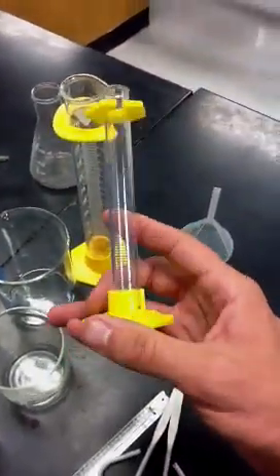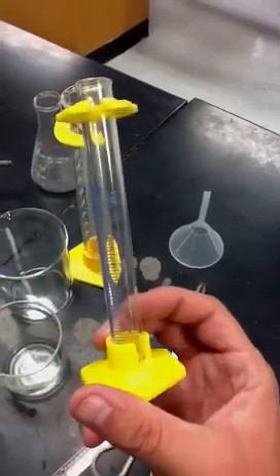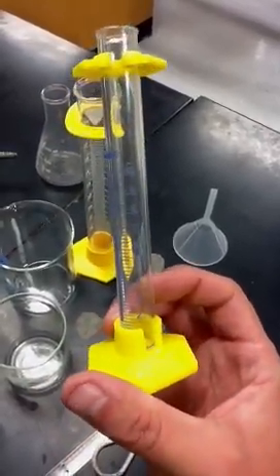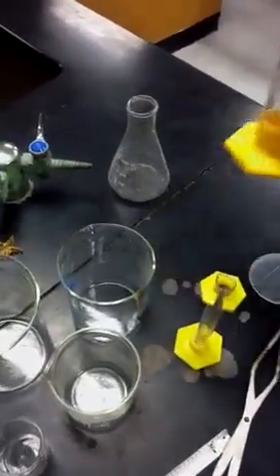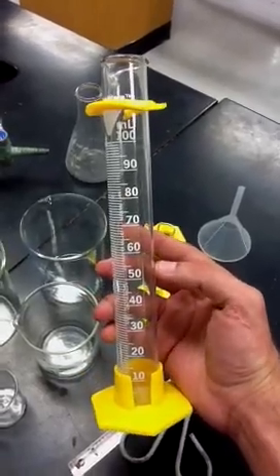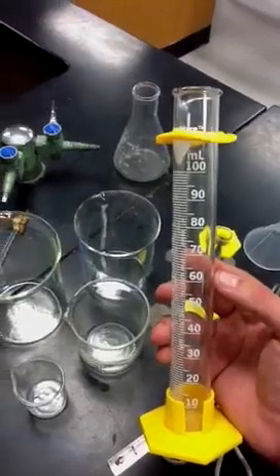To measure also, we have these things — they're called graduated cylinders. They're narrower, but they come in different sizes as well. This one is a 10 milliliter graduated cylinder and the markings on the side go up by 1 milliliter. This is the big cousin — a 100 milliliter graduated cylinder — and it goes up by 10s. If you want to be really accurate, you want to use one of these instead of a beaker.